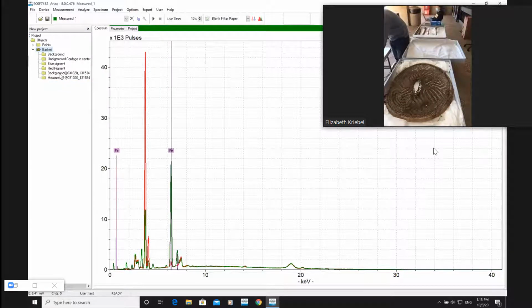So, I always heard that it's safe to handle with gloves and store in low light. Should I add anything to that, or is that adequate? Those are the two takeaways.